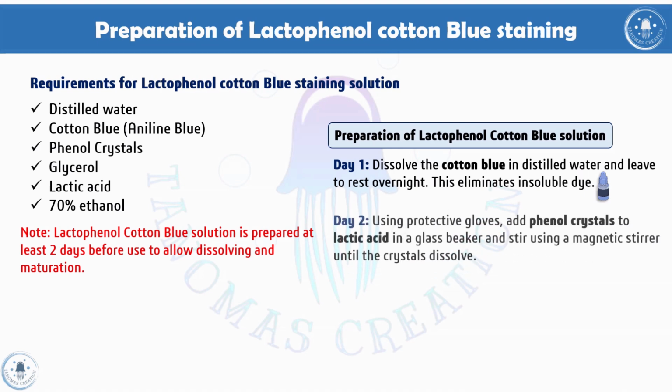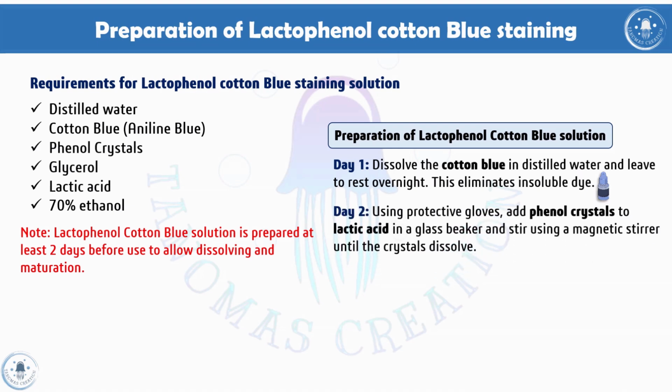Now on day 2, you take a glass beaker, put lactic acid in it, and add some phenol crystals to the lactic acid. All these procedures should be carried out using protective gloves only, to avoid contact with your skin, because you are using acid. So use protective gloves for preparing this lactophenol cotton blue solution.